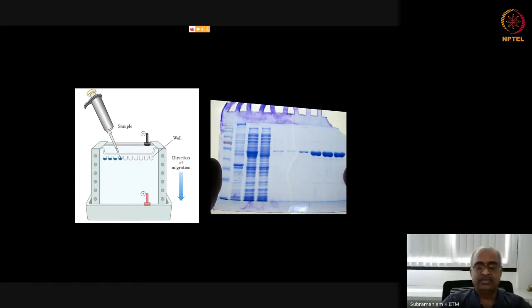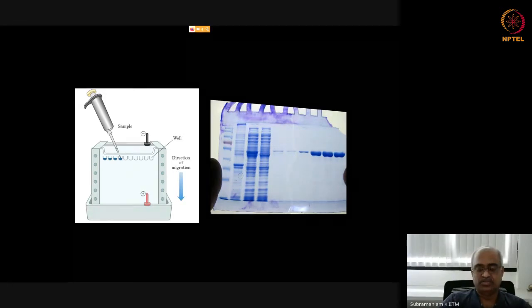So you add the agarose into that, then you put it in the microwave and heat it, and then it melts and it dissolves into the liquid. So it becomes clear liquid. Essentially, the long polysaccharides are hydrated in this heating process with the buffer. The buffer is primarily water. So now when you allow it to cool, then it slowly becomes a gel. It solidifies and becomes a uniform gel.